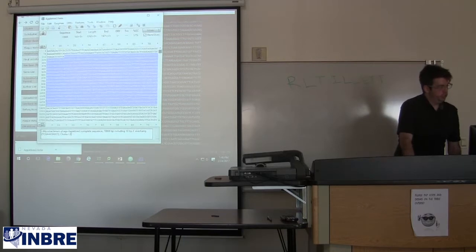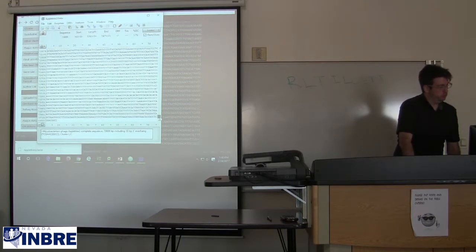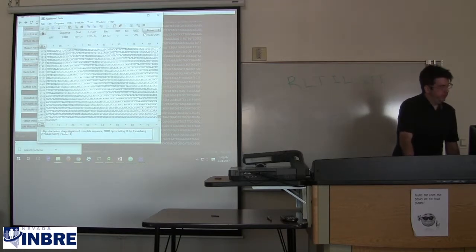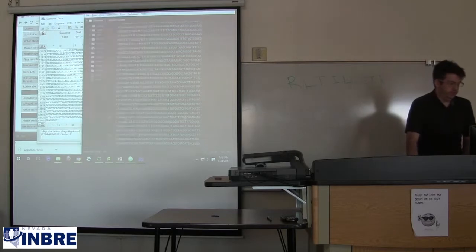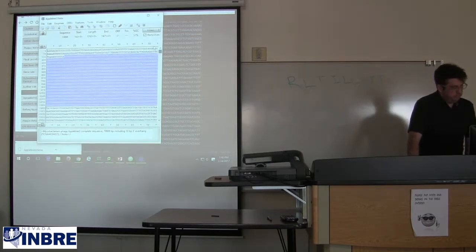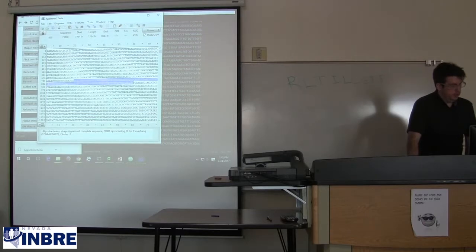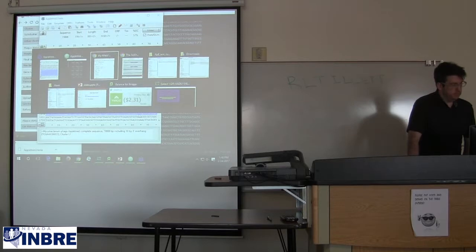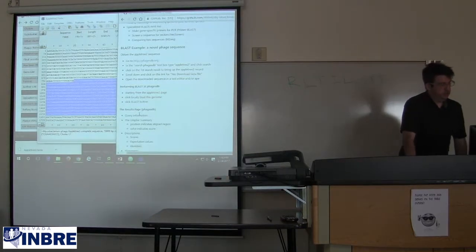If we scroll all the way down, I suggest using the scroll bar on the right, down to 73,808 at the end. So we have the full sequence loaded up in both. And we'll be able to proceed.